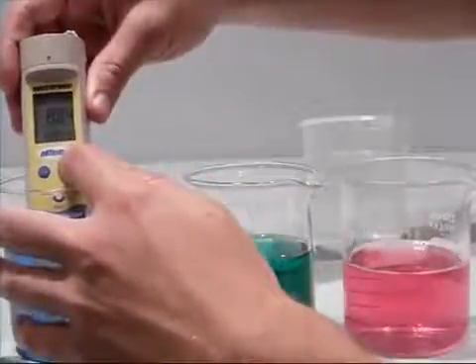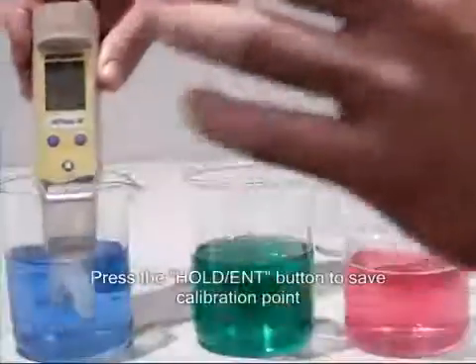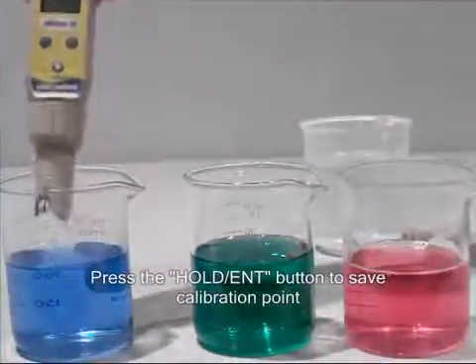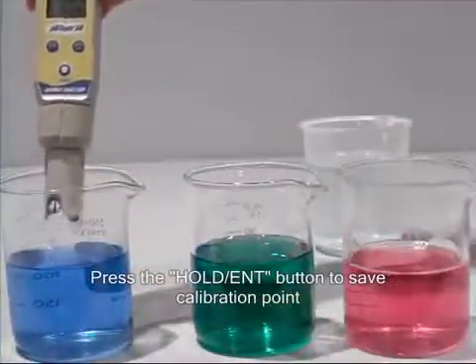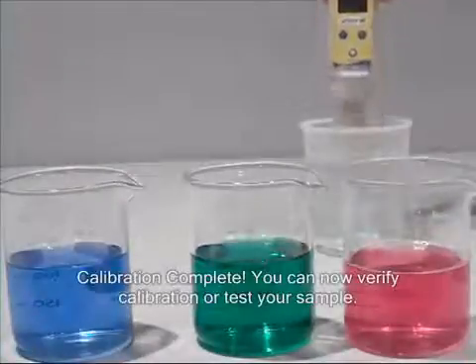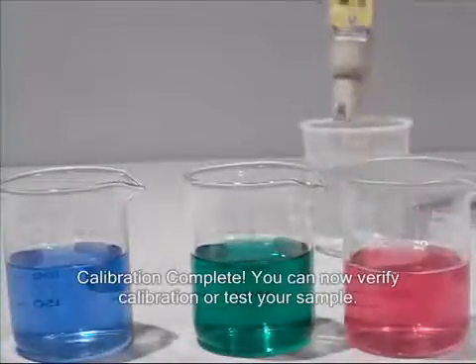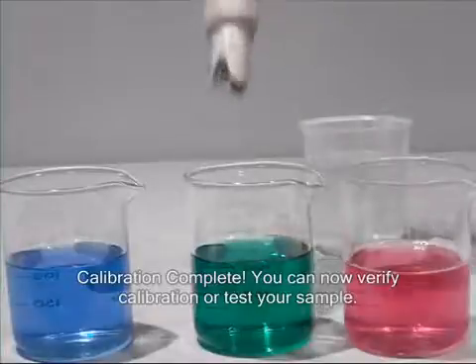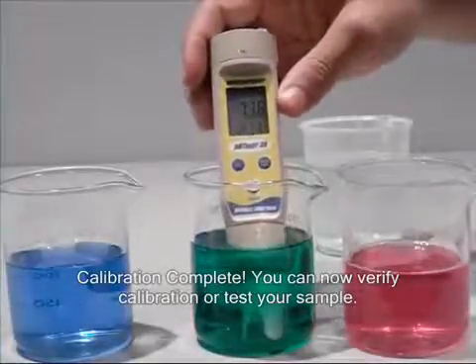Press the hold enter key to confirm the final calibration point. The tester will then return to measurement mode. At this point, you can rinse the tester and confirm the calibration by placing in any of the pH buffers or take a reading of your sample.